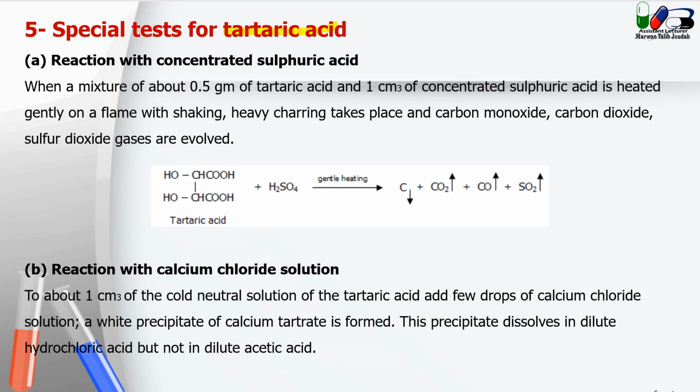So this kind of test is broken down into more than one section. First of all, the reaction with concentrated sulfuric acid. So the reaction of tartaric acid with sulfuric acid, it must be concentrated.